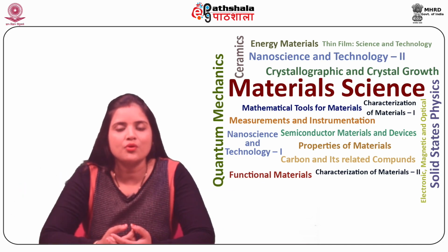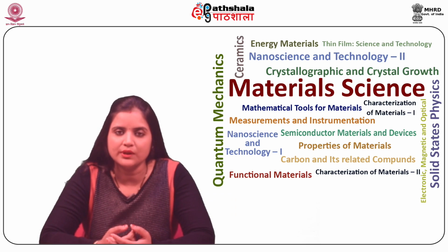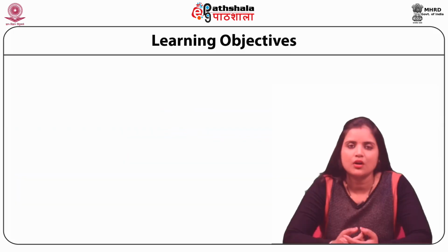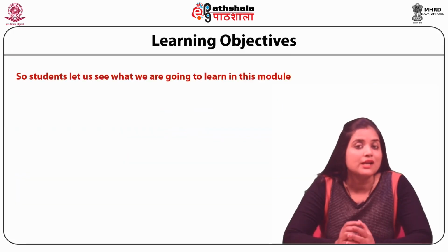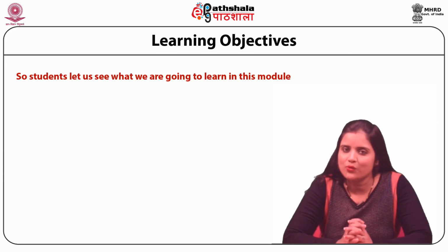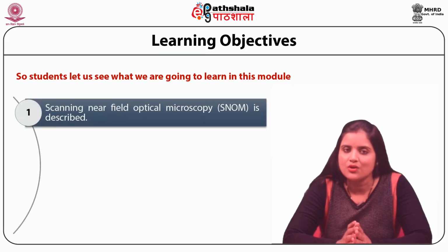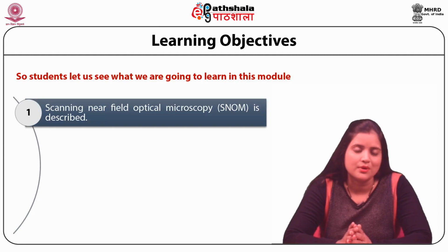Today we are going to discuss the module Scanning Near Field Optical Microscopy from the paper Characterization of Materials 1. So students, let us see what we are going to learn in this module. In this module, scanning near field optical microscopy, that is SNOM, is described.